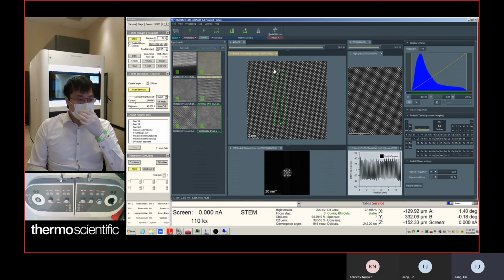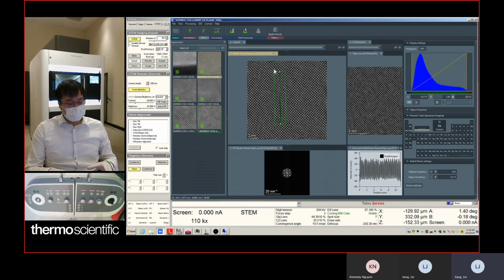After the training, I will create a Box link with all the materials in there, and also include some imaging we take in this training for you to share with the users as well. Like today, we're going to take a look at the camera length effects.